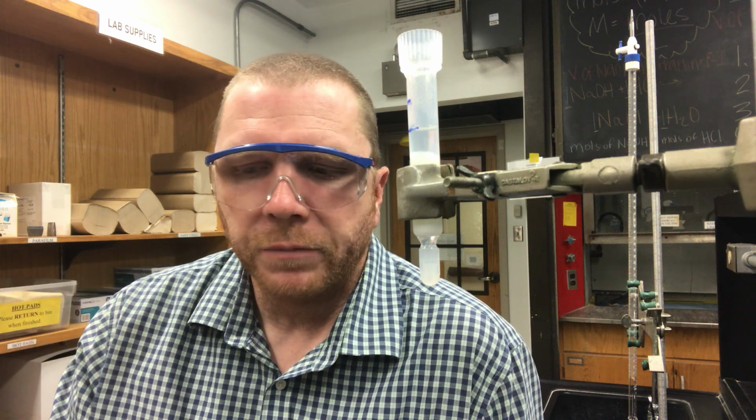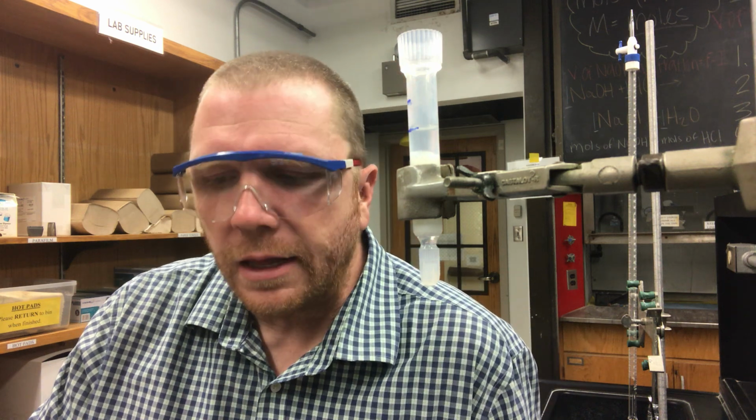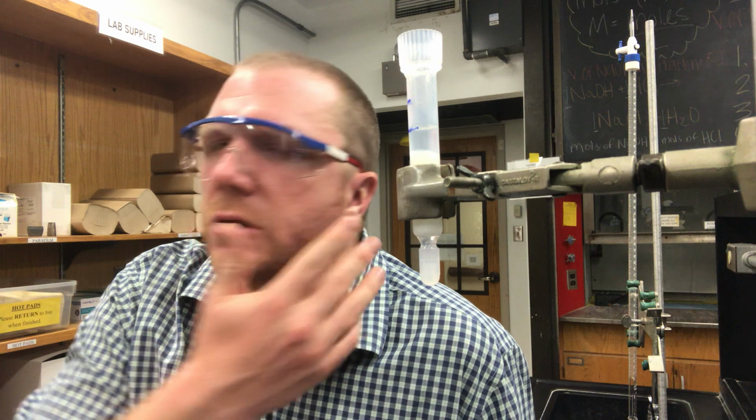Now, what I'm running through this column right now is simply a sodium phosphate buffer. So the chances that there's anything insoluble in that sodium phosphate buffer is extremely low. When you load the protein sample where you're going to try to get LDH to adhere to this column, well, there's probably going to be some more stuff in there. And by that I mean insoluble things, insoluble sugars or lipids or something like that.